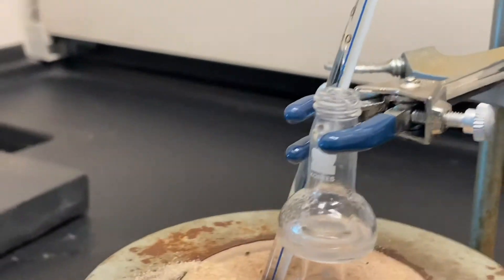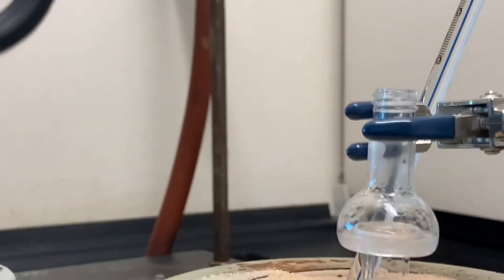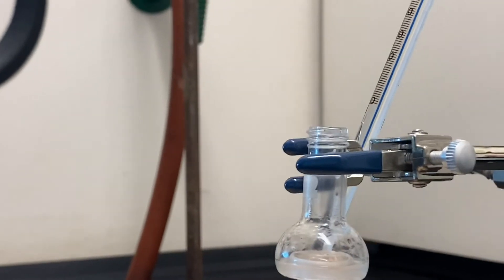When you see no more distillate condensing in the collection ring, unplug the sand bath.